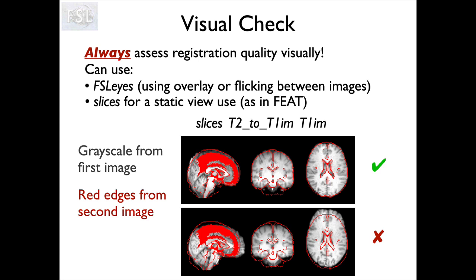When registration is not aligned well, it's very obvious — you don't need to be any expert to see that it hasn't worked, because the red edge clearly doesn't match the edge of the grayscale image, particularly at the front of the brain in the axial view and also clearly in the sagittal. It's less obvious in the coronal, which is something to keep in mind. It's really good to always look at all three orthogonal slices, because sometimes one won't be very obvious.